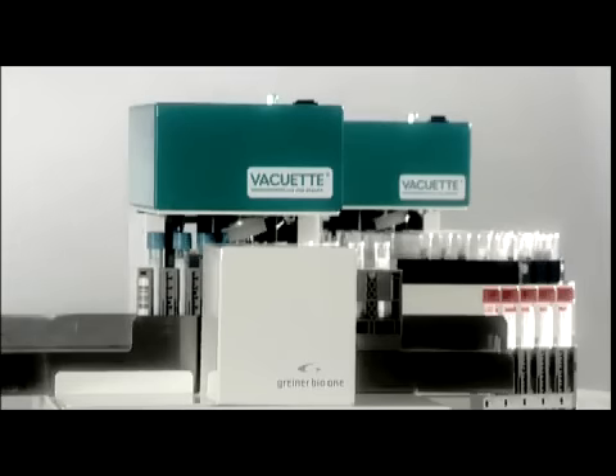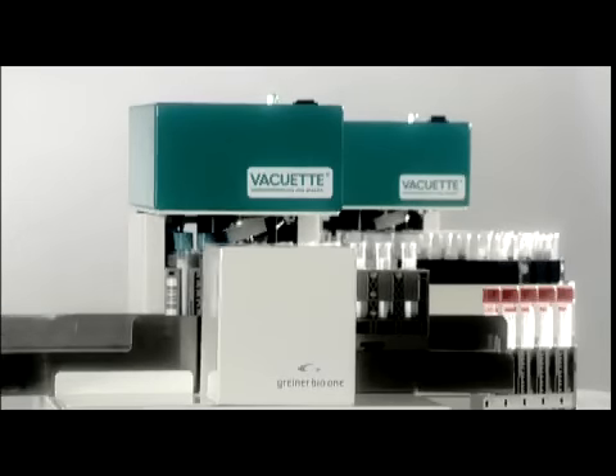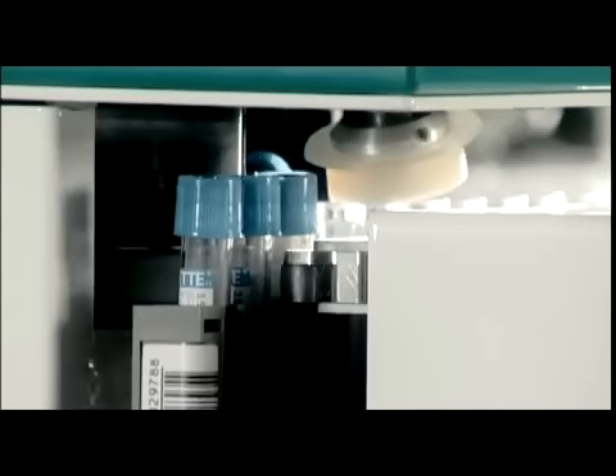The instrument opens all different tube types, regardless of whether the tubes are of different lengths or not. With a compact, robust, and mechanically simple structure, the instrument is very reliable.